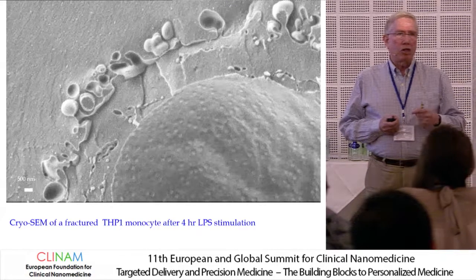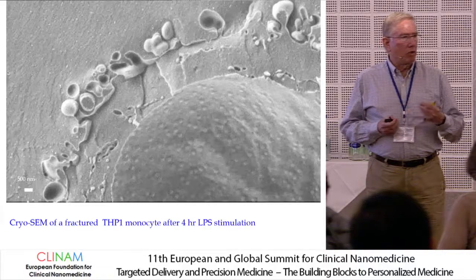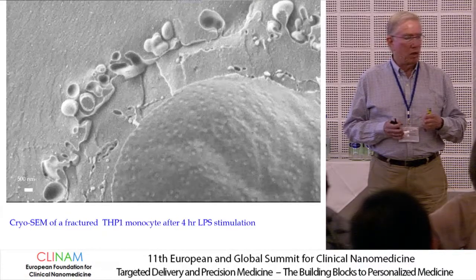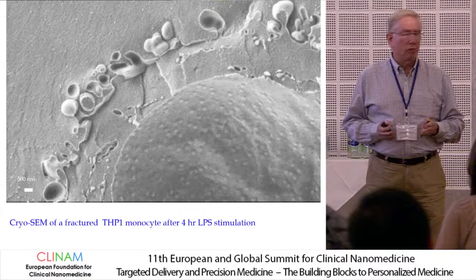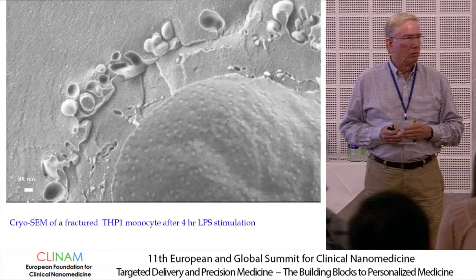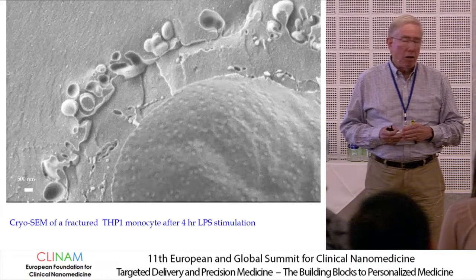once we are beyond just methodology development, with examples, we will be able to concentrate on specific systems and actually do the quantification. With modern computers and image analysis software, this is not too difficult to do. But roughly, now that you've done a few images, how often do you see the vesicles with the extensions? About 50%, roughly. 50%? Yeah, roughly.